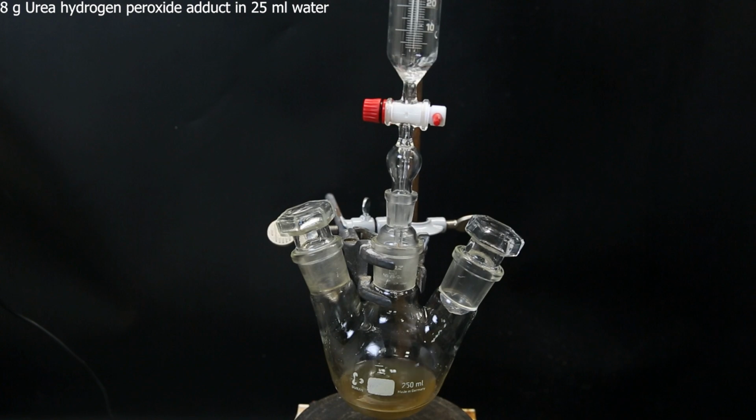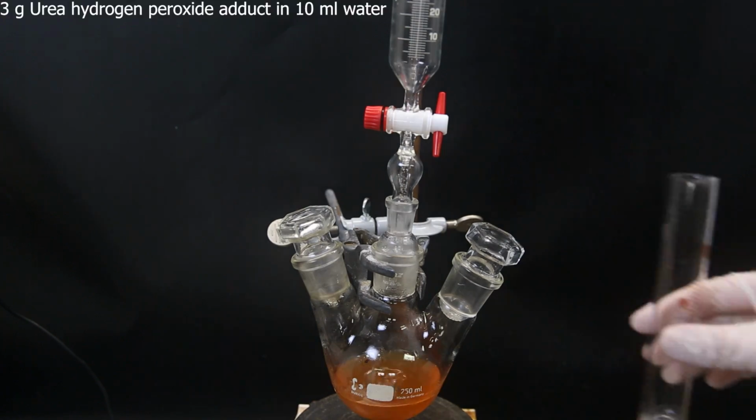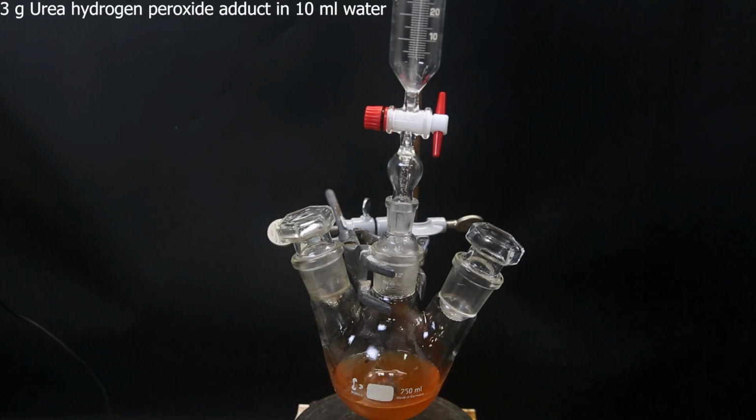The dissolution of this adduct is endothermic, so the solution is actually at 0 C, which is handy since it has to be cold. Now to start the reaction, I dropwise add the solution to the flask. Gradually the solution in the flask turns darker, and eventually becomes red. When the addition is complete, I add a bit more of the urea hydrogen peroxide adduct to make sure it all reacts. I then leave it to stir for an hour.